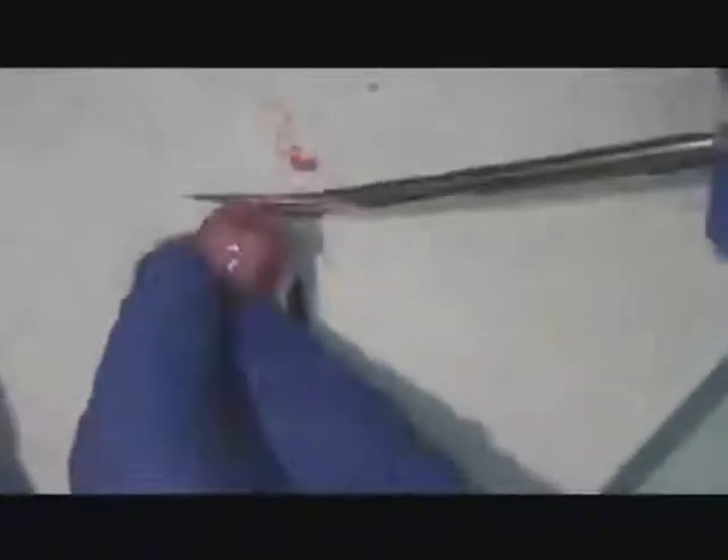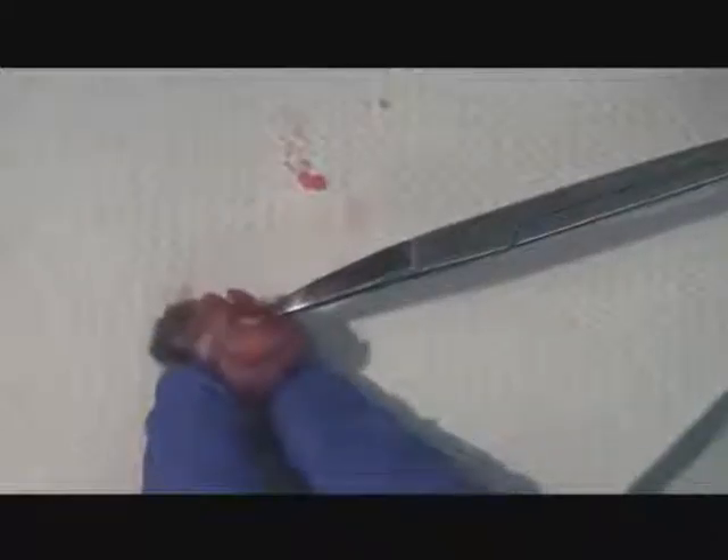Remove the tissue from all around. The intention is to get the top of the skull free of connective tissue. After the tissue is removed, you are ready to remove the skull cap.